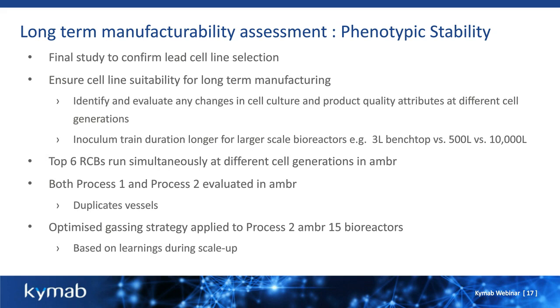The phenotypic stability study is quite important as you don't want your cell culture or product quality attributes to change as the cells age during inoculum train expansion.